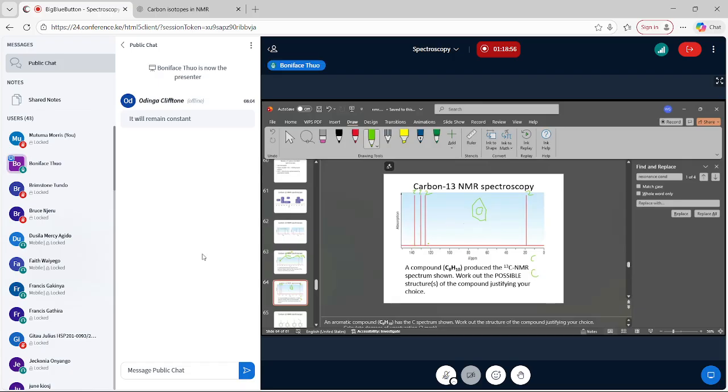Okay, because of the chemical shifts and the fact that we have 6 carbon atoms, we can confirm that by calculating elements of unsaturation. Okay, so the elements of unsaturation is 1. We add the number of carbons, which is 8.